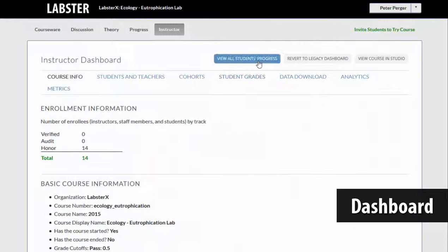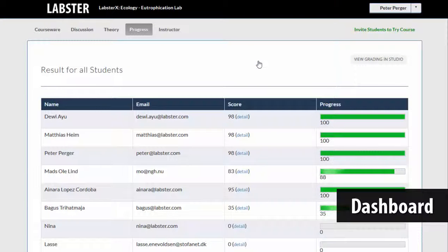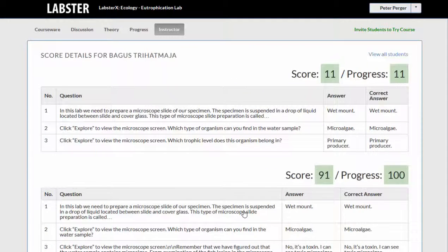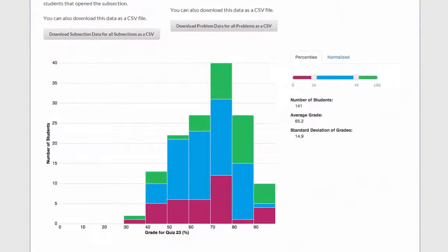Both students and teachers have a full dashboard that allows a clear progress overview, student scores, and allows teachers to see which parts of the course they should review.